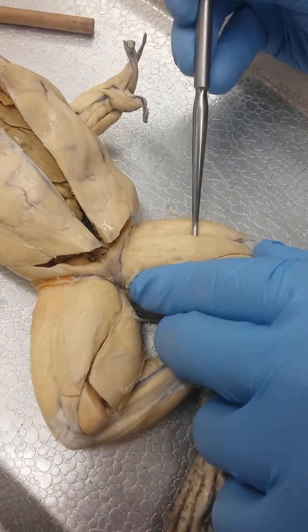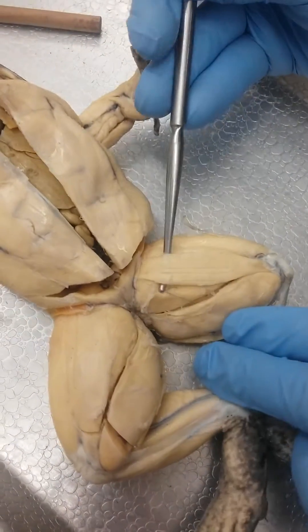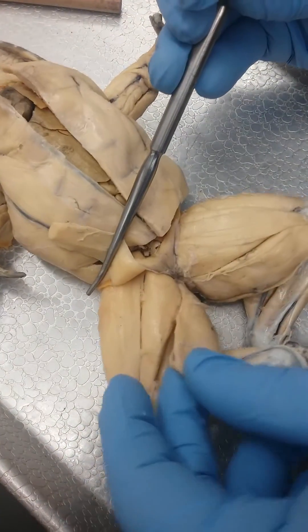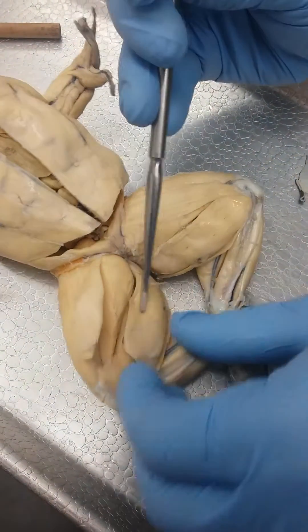This here is sartorius. And this is also sartorius, but if you pull sartorius — I call this gracilis major.